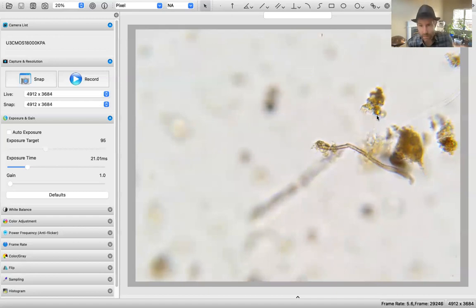0.1, and that particular tan fungi, 1, 2, 3, we're going to go with a 0.3. And that to me looks like 1, 2, looks like a 3. Maybe it's 2.5, I'd say. 2.5 micrometers. And that's a fungi, and it's tan. Okay, excellent. Moving forward here.